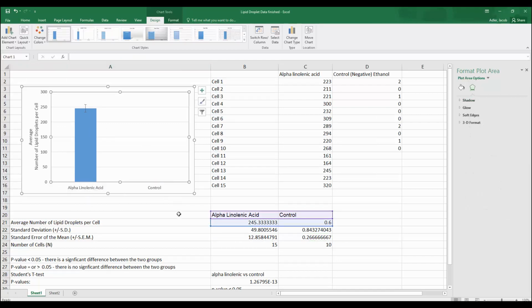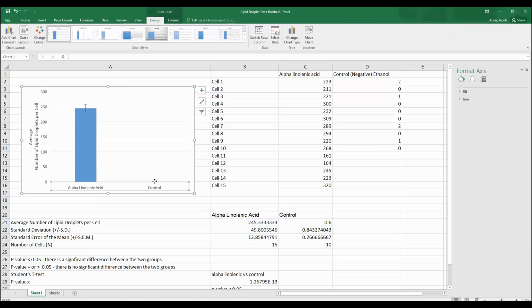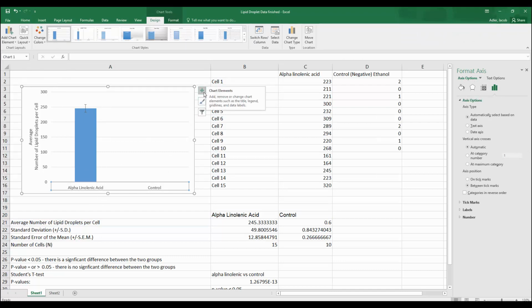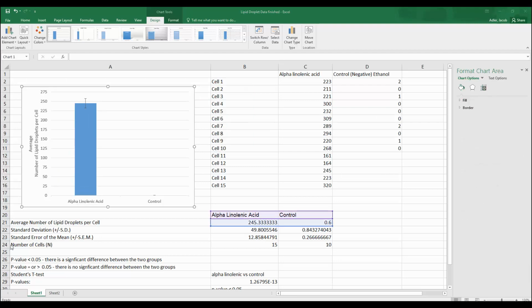And what it's done, as you'll notice, is this one's so small it doesn't even show up. But this one, you can actually see the actual error bar there. Now, if we're having trouble graphing this, we can change how this is set up. So we can change how these axes are. What I've done here is manipulate the chart data.